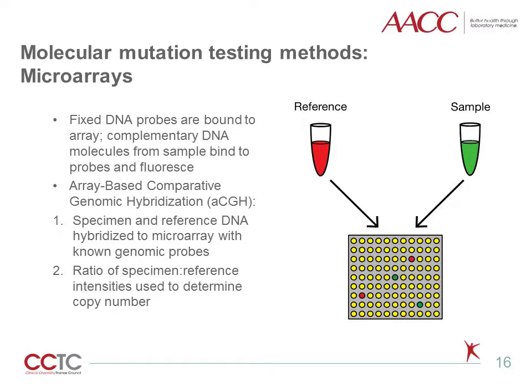DNA microarrays consist of known sequence-specific probes covalently bonded to a microarray chip. The input sample nucleic acid is first fluorescently labeled and then hybridized to the chip. Probes that bind to sample nucleic acid emit fluorescence and effectively genotype nucleic acid for that sequence.